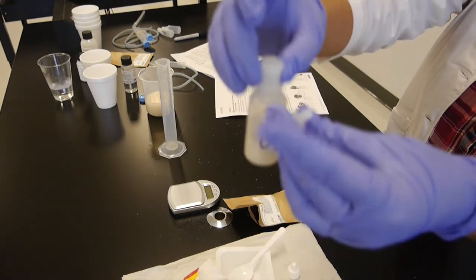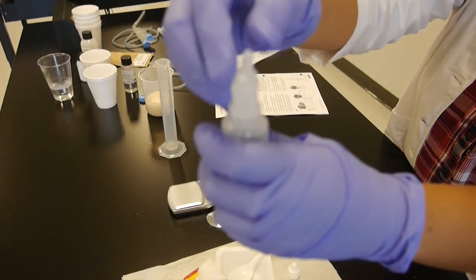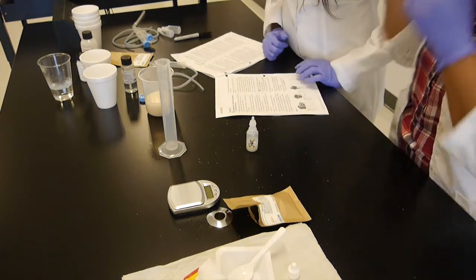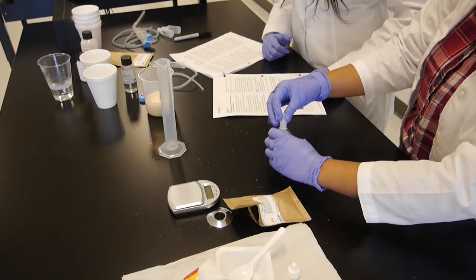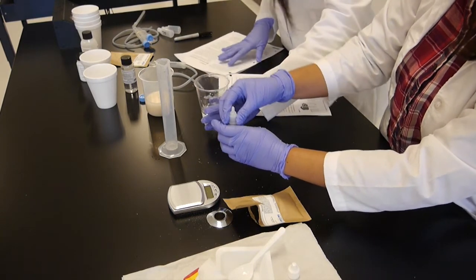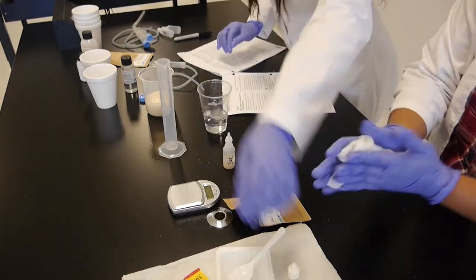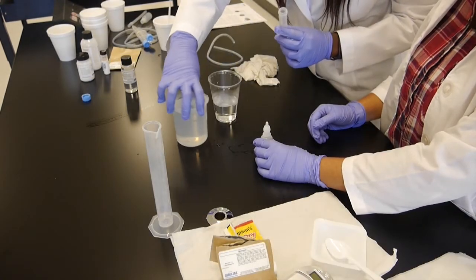Okay, now let me put the top of the dropper. Okay, now we're gonna set up, when this reaction is happening, the carbon dioxide gas getting produced, we're gonna set up that tube. So we're about to attempt the setup.